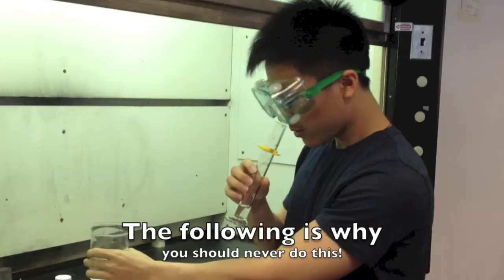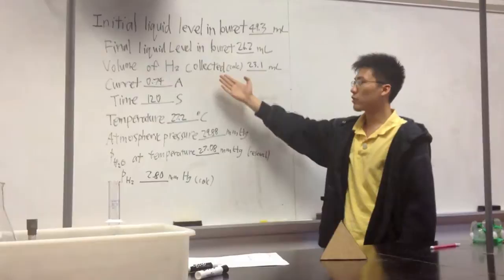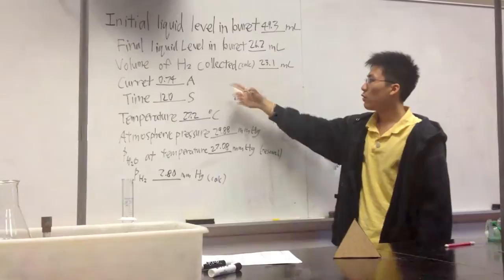Alright, here are the results. Here we have the initial liquid level which you measure before you do the experiment, and here we have the final liquid level which we measure after we do the experiment. This is going well so far. Here we have the volume of H2 collected and it's the final liquid level subtracted from the initial liquid level.